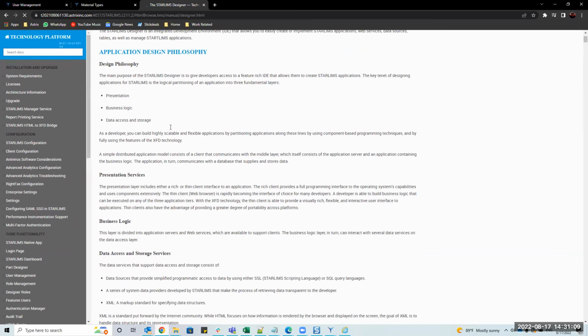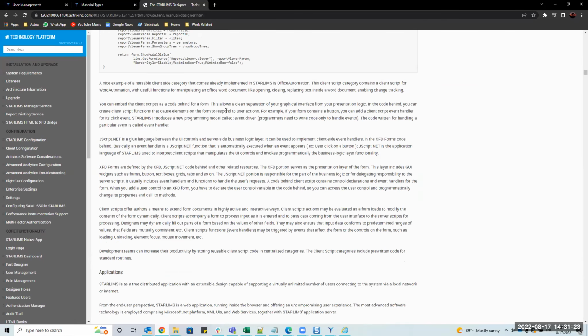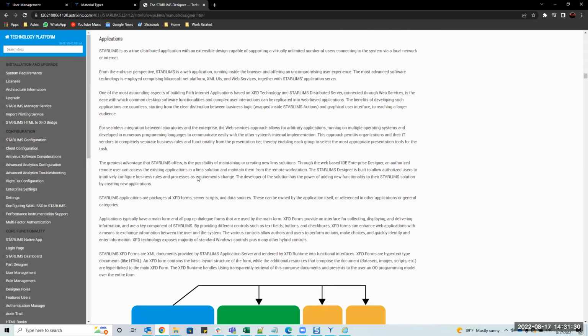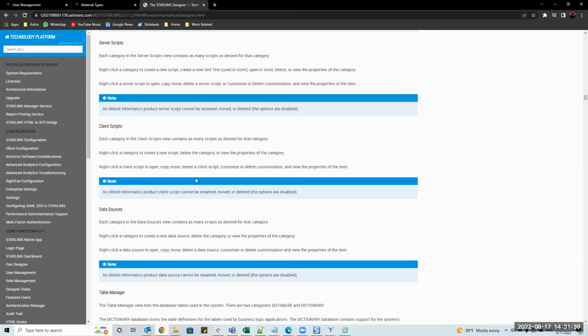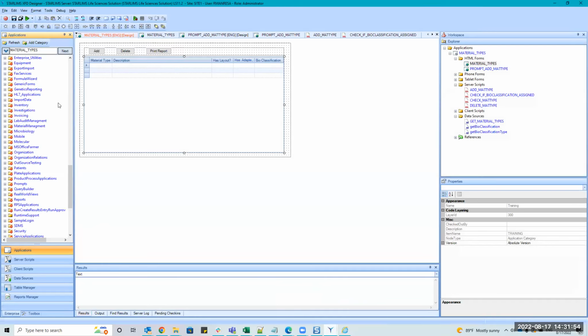With more details. I shared this with Jose. I wanted you guys also to have this information, do some self-training, review all of this, or as much as you can, as much time as you can give to this, and then come to me with questions. But first, let's get through today and Friday, right? Let's not get overwhelmed, like, oh my God, this is all this information, what's this guy talking about? We're going to give you the introduction, but it's not enough, is my point. So I'm pointing you to a few resources, mainly the actual system, and then the help manual.